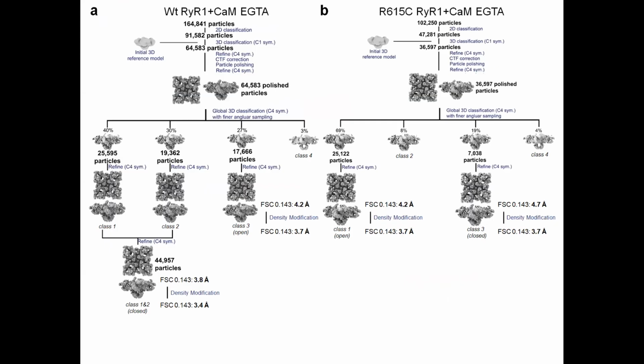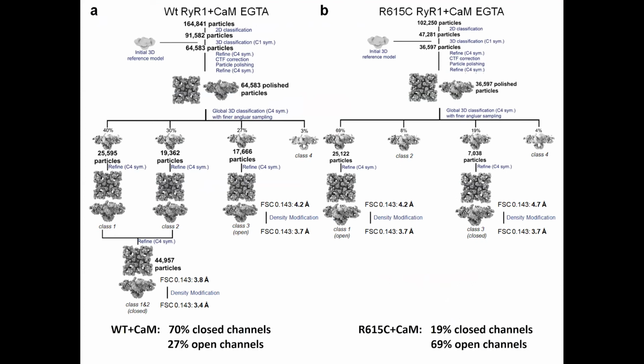So there's a certain pipeline that you can follow when processing a cryo-EM data set. And this may look complicated, but essentially what it allowed us to do, we had data sets for the wild type RYR1 with apocam, also for the disease mutant RYR1 with apocam. And essentially for each, we actually got two different structures. And so for the wild type, we actually got 70% of the channels appear to be in a closed structure, and about 30% were open. Whereas for the disease mutant, it's almost inverted. You've got a smaller proportion of closed channels, but most channels are actually open.